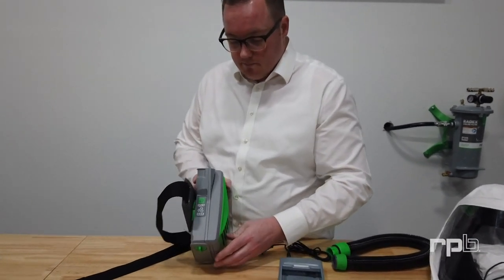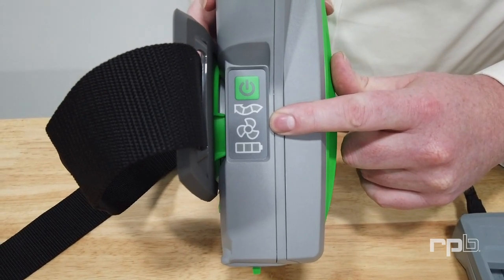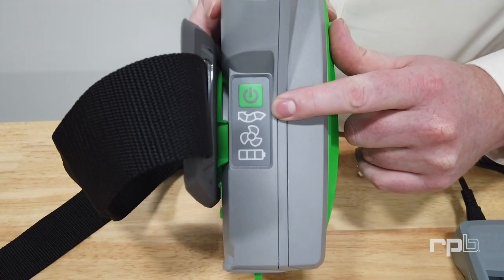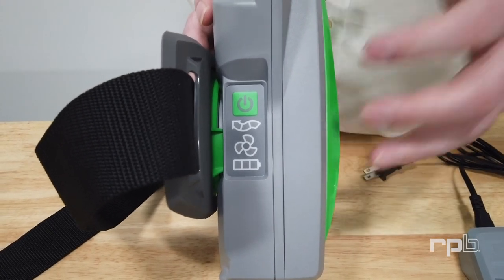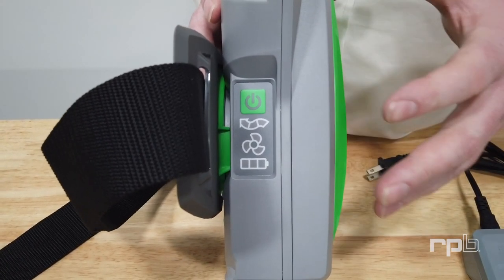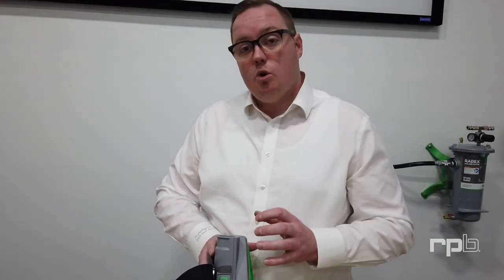On the side of the PX5, you have several indicators. The first is your battery life indicator. You've then got your fan speed indicator — you can adjust the fan speed by pressing the on/off button. You then have a filter life indicator, which will change colour as the filter becomes clogged, alerting you that you need to replace that filter once there's not enough airflow to keep you breathing within your respirator. Once the battery gets too flat or the filter becomes too clogged, the unit will start to alarm and vibrate, alerting you to remove yourself from the environment to either change the battery or replace the filters.